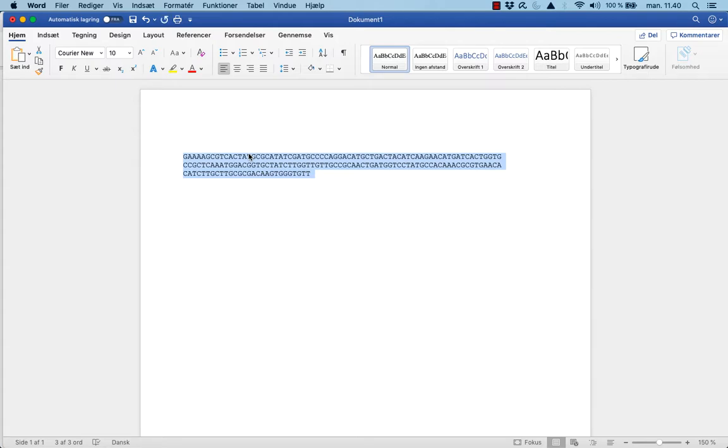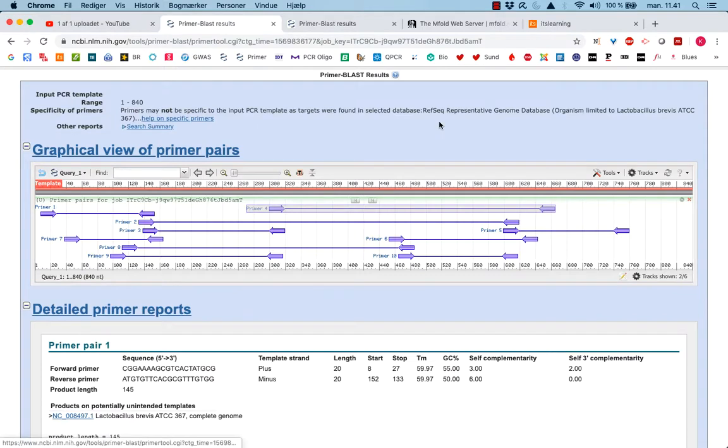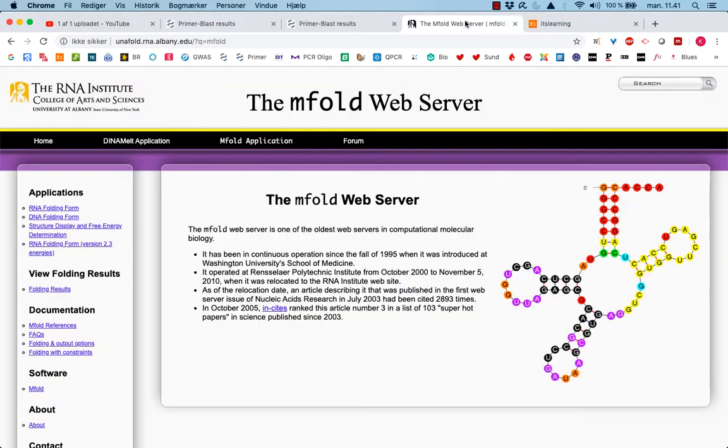I copy this and I go to the MFOLD web server. MFOLD is something that will look at secondary structure.